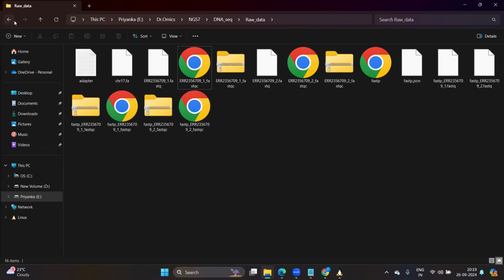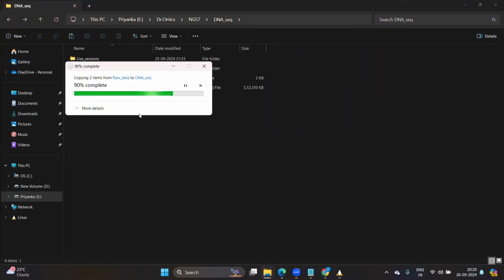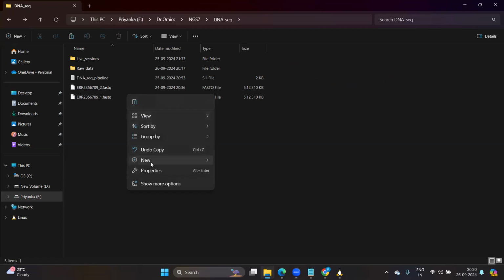So I'll make a zip file for this and share it with you, so that you can also try to perform the next steps.